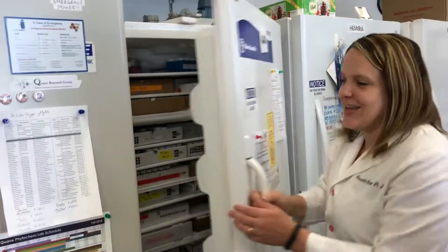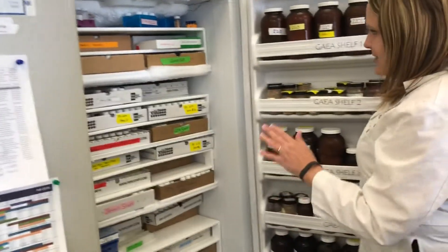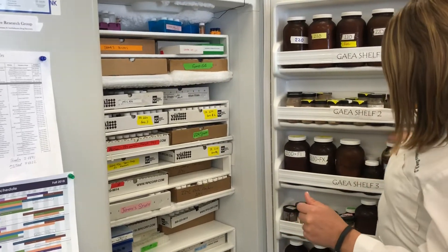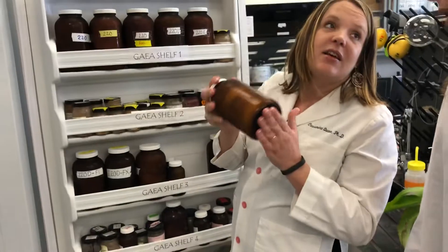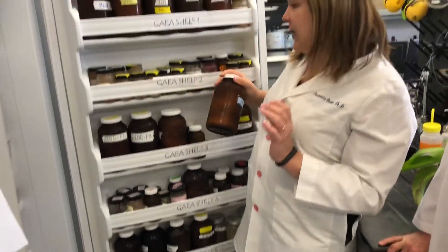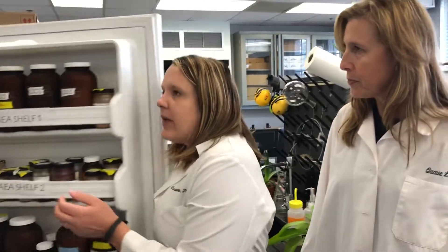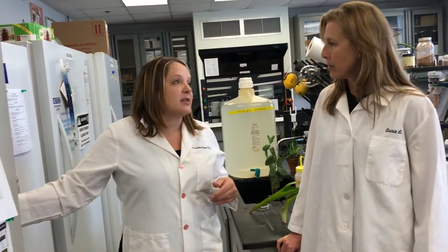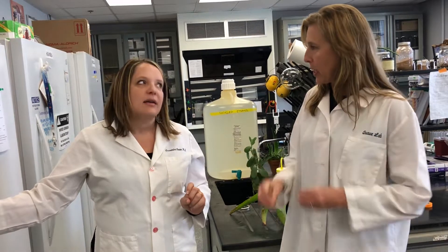This is just a part of the library. These are each numbered by collections. We also have, for our major projects, big jars of extract — we make a lot of it. Because in the end, the active compounds that we find in the plant may only be like 0.01 percent of the overall extract. So it takes a lot to get down to that 0.01 percent, and you would need a huge amount of material in order to get that.